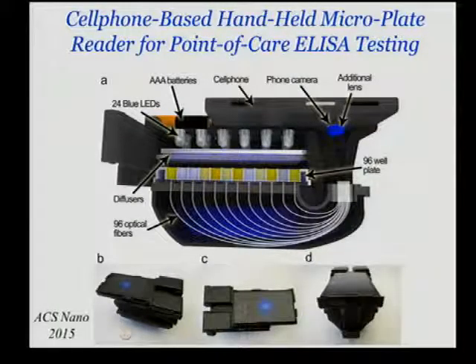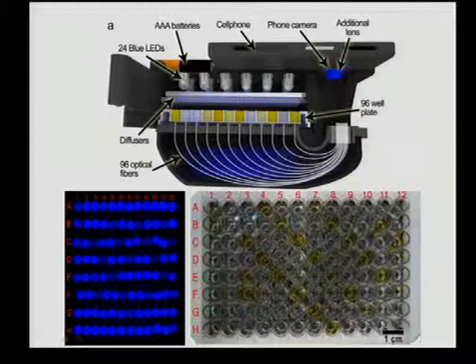And finally, I'd like to mention that you can bring some other interesting tools for spatially multiplex sensing. What you're seeing here is a microplate reader. Microplate is essentially a plate. It can come in different formats. What you see here is a 96-well plate microplate. Essentially, it's a standard format for a lot of the clinical tests, a lot of the ELISA tests for the samples that you give in a clinical lab. They're using this kind of platform for looking at color changes or for looking at fluorescence to quantify the biomarker concentration or give you a diagnostic decision.